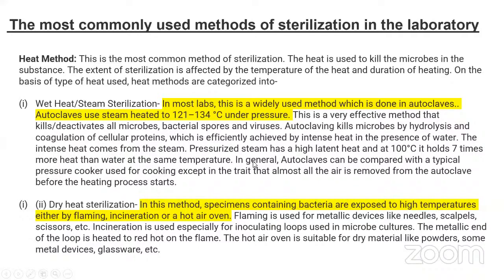So this protocol of wet heat or steam sterilization is normally used in the laboratory for autoclaving lab experiments or lab reagents before starting any experiment.